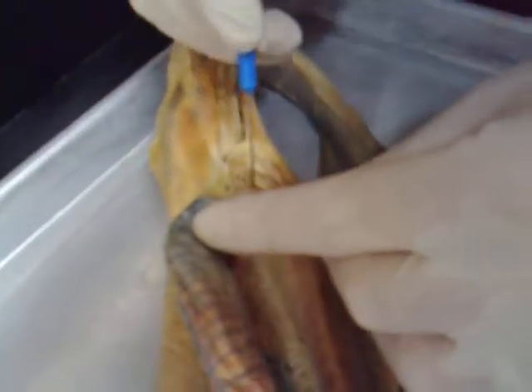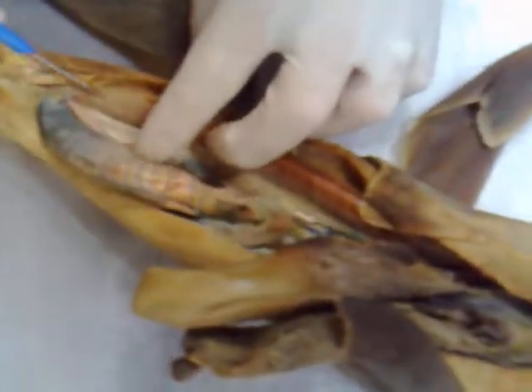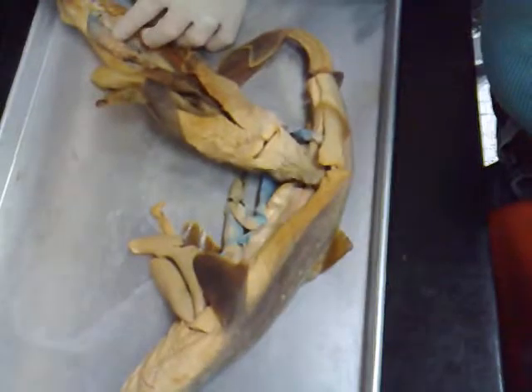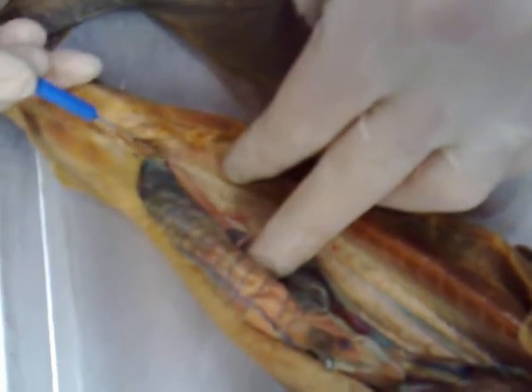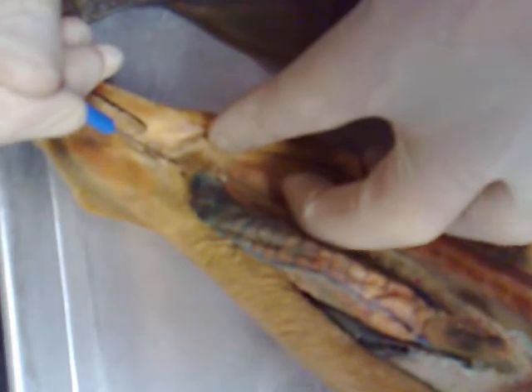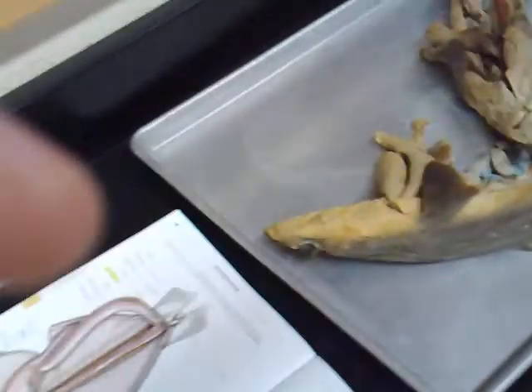And then the sperm sac — all the way down here. You come down squiggle, squiggle, squiggle, then it becomes the seminal vesicle. Squiggle, squiggle down here becomes the seminal vesicle, and then you track this to right there — that's the sperm sac, that container right there.